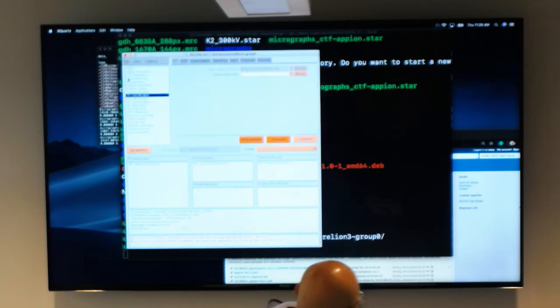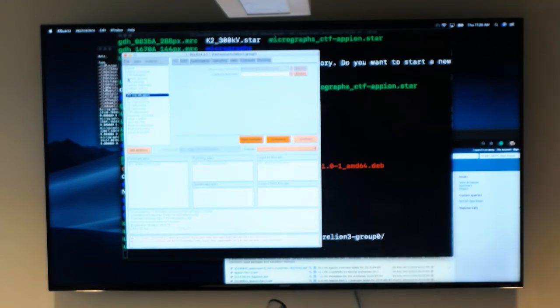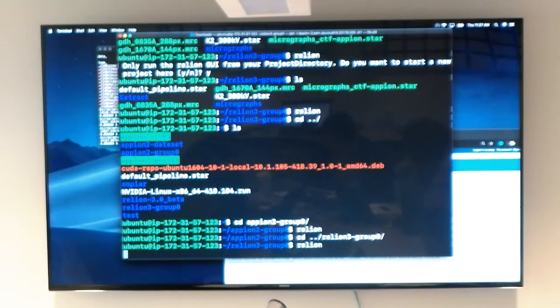Alrighty. So if you're starting to run 2D, you can display. Even though this display doesn't have everything, you can go to File, Display, and you can see intermediate runs if you're running. The final result. Plus 2D. I can set my display not to fall asleep.